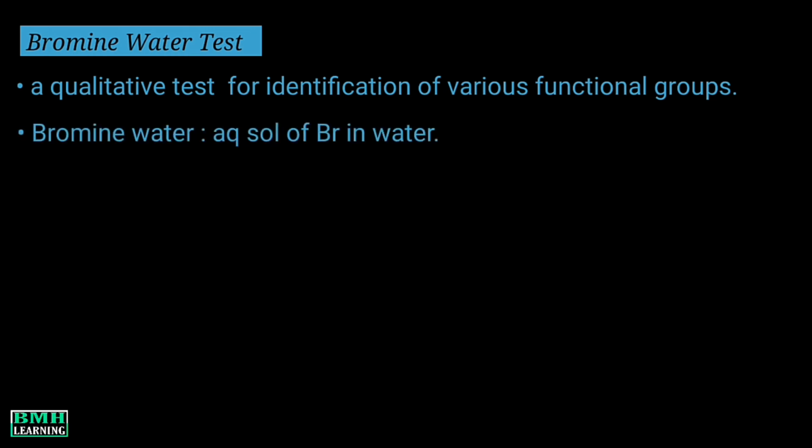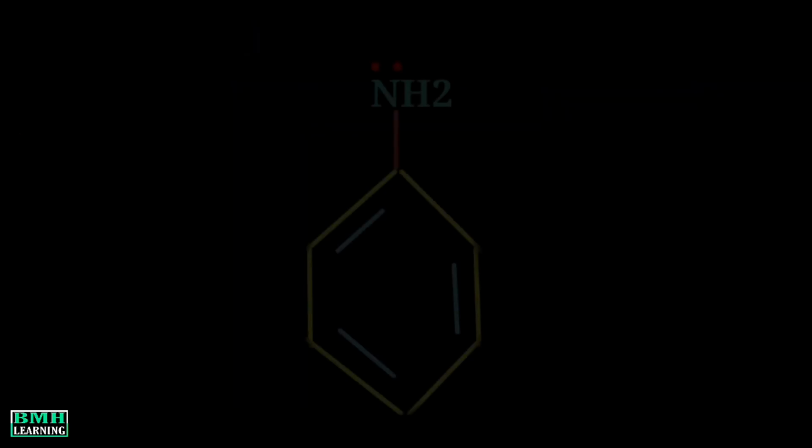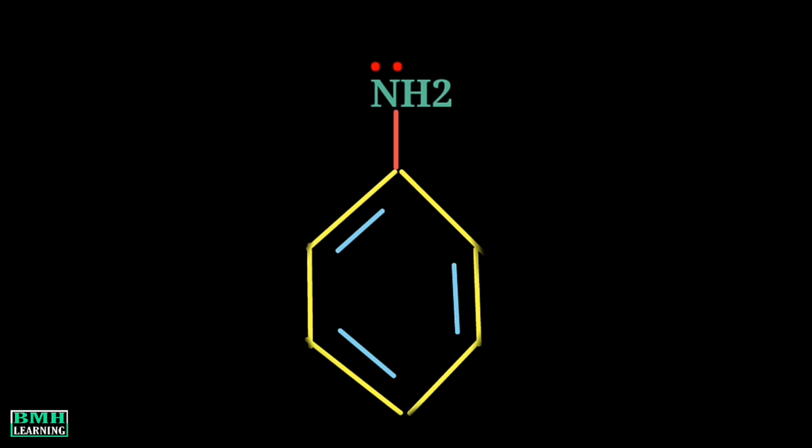Bromine water is nothing but an aqueous solution of bromine in water. In this video, we look at the reaction of the benzene ring in aniline with bromine water. So you would be able to know why the amino group of aniline activates the benzene ring.